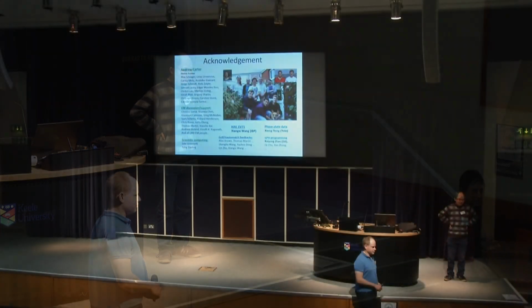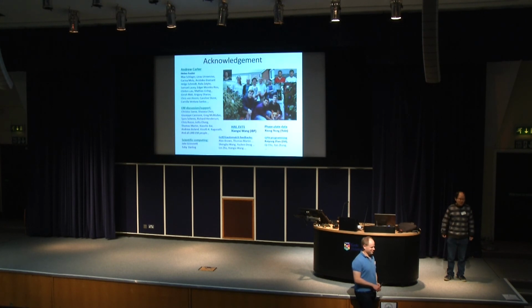It's the basic calibration of the microscope. That's true. How much you can account for defocus. Yes. So it's a maximum. Exactly. It's basically calibration. Yeah.